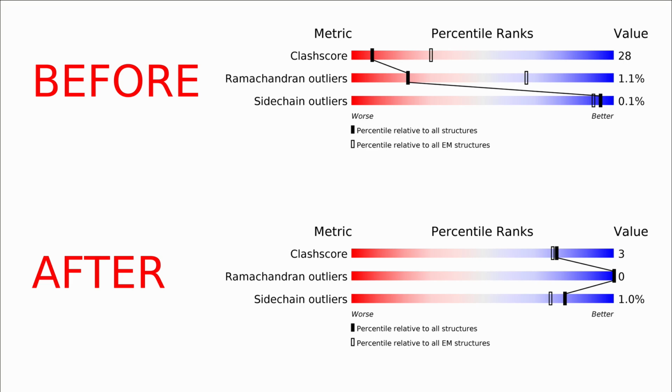On the top, we have the PDB validation sliders for the original deposited model. On the bottom, we have my result after about a week of work in ISOLDE combined with tightly restrained refinement in Phenix real-space refine. Obviously an improvement, but a simple glance at these might leave the naive viewer asking, why did it take a whole week to do that?